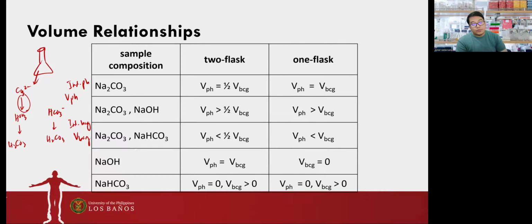Okay, so as we have established earlier, kung ano yung amount na nagamit dito sa carbonate to bicarb, let's make that as X. Then yung bicarb na dito lang sa ladder na to, yung X na yon dapat equal dun sa amount na bicarb to carbonic acid. Pero not necessarily parehas dito kasi most likely ibang amount yon based dun sa amount ng sodium bicarbonate na present initially dun sa ating mixture.